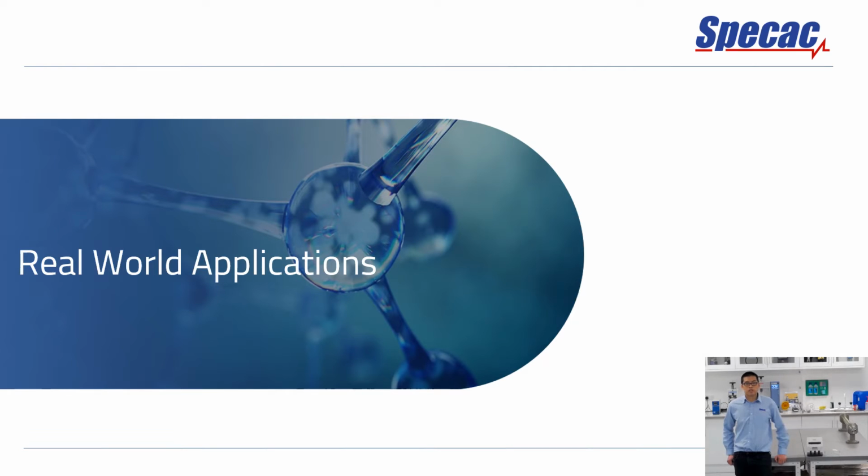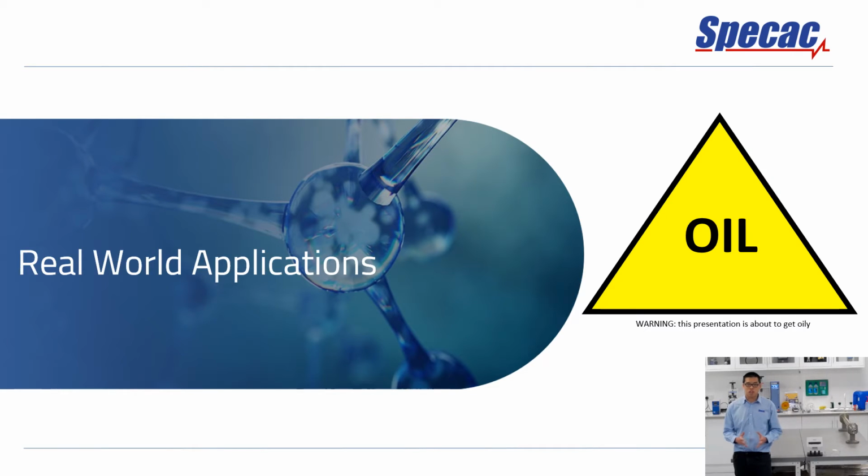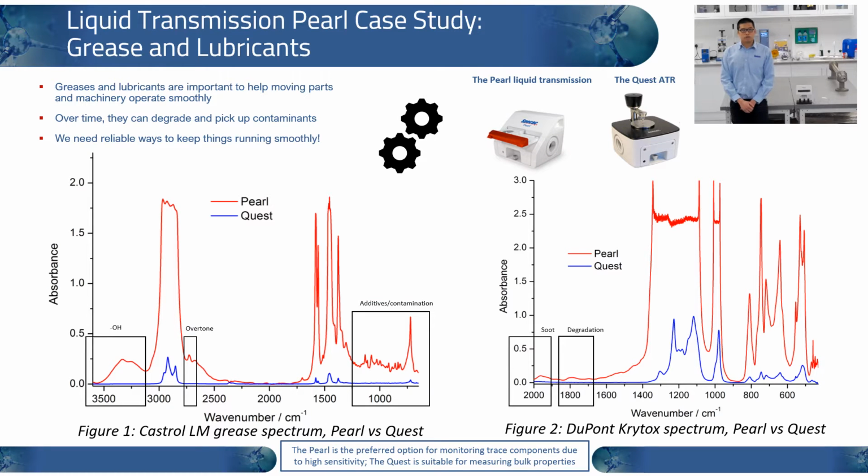In the next few slides, we'll be diving into some real-world applications. But just a little warning for you all, the slides will become very oily. The first application we'll be looking at is greases and lubricants. Greases and lubricants are important to help moving parts of machinery operate smoothly. Over time, the oil or grease or lubricant will degrade and pick up contaminants, and there'll be a chemical change in the spectra. So we need reliable ways to keep things running smoothly.